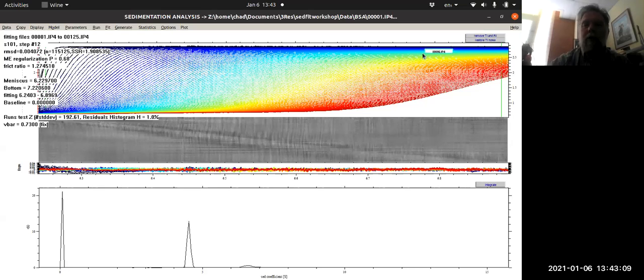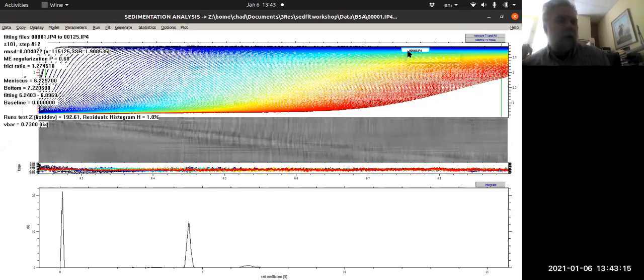I see nothing. So I'm going to end it a little bit early so I can get things set up for a quick demonstration on how to load things. I'm going to try to assemble a cell, and I brought some samples. Where did I leave my samples? I think I left them in the lab.